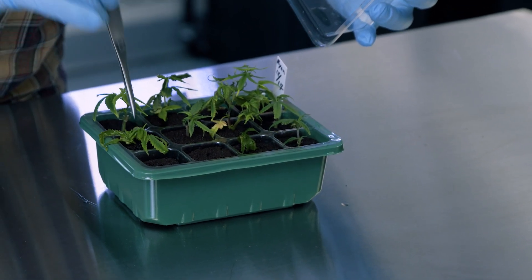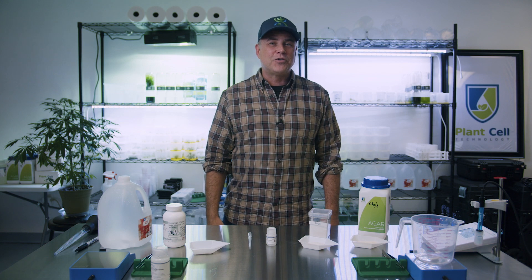We are here to show you the fundamental elements of plant tissue culture and how easy it is that you could do it at home.